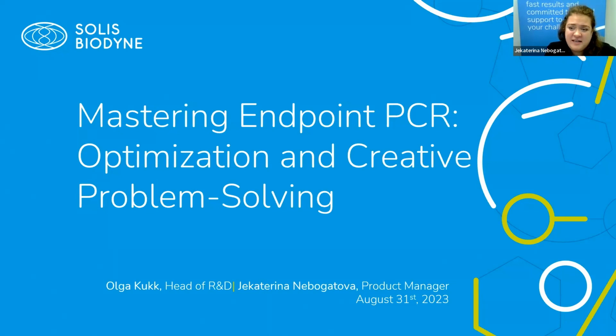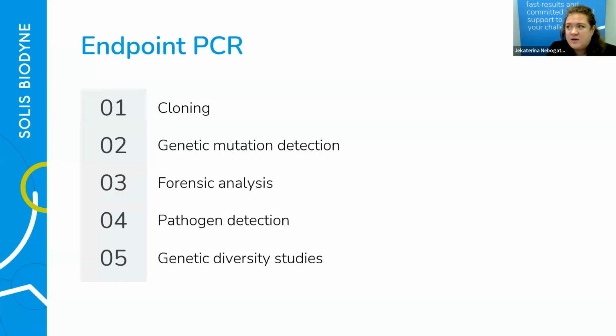Let's dive into the topic of today's webinar and find out how you can master endpoint PCR by optimization and creative problem solving. PCR, polymerase chain reaction, was invented about 40 years ago, and it's still a gold standard. Depending on the aim of the assay, other modern techniques like isothermal amplification, NGS, CRISPR, etc. can be applied. Each type of technique has its own benefits, but it also has its limitations.